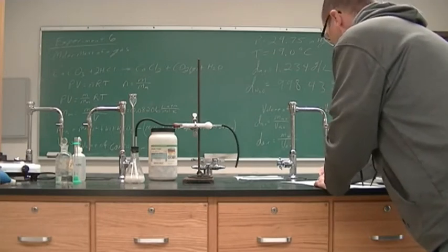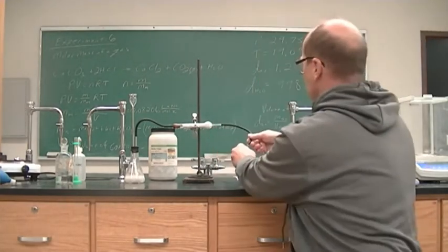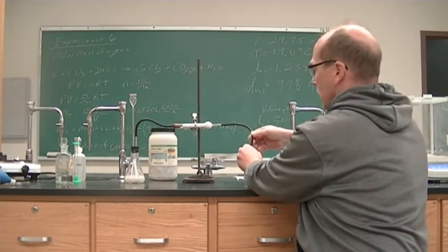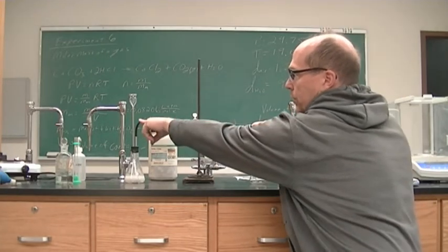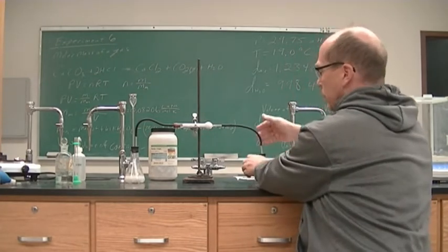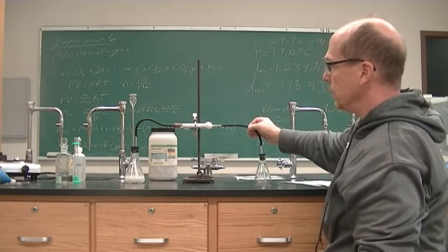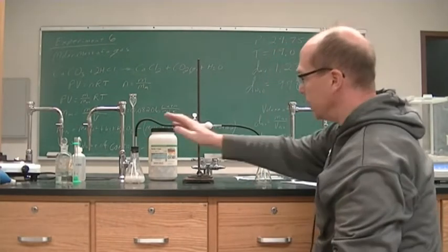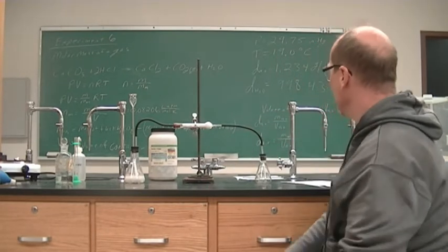69.1950 grams. All right, and to make sure that it is completely full of CO2, you can hook it back up. Make sure the gas is still coming through, yes. And I'll let this go up. You can see that the CO2 is still being generated at a good rate. Maybe you can see that going up to the top. And then I let go and it comes down, and now the gas is free to come over into our flask here.